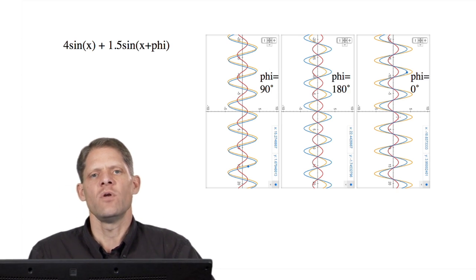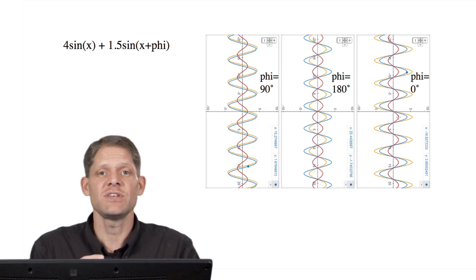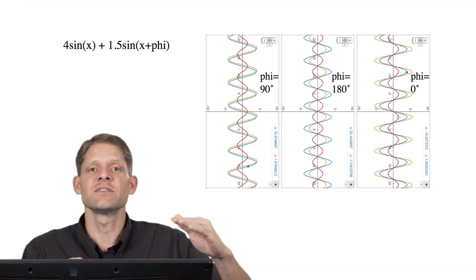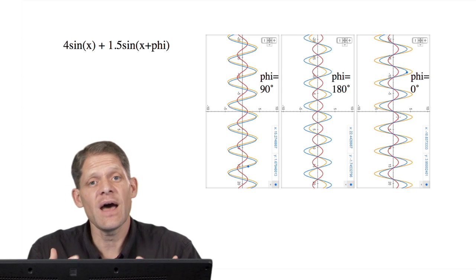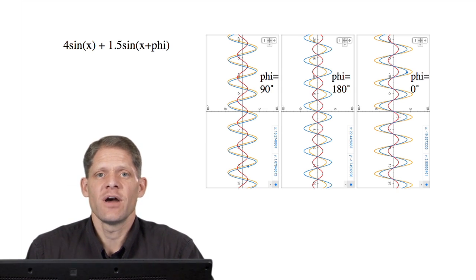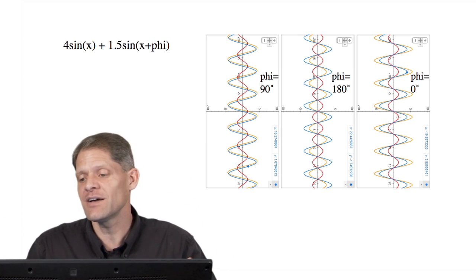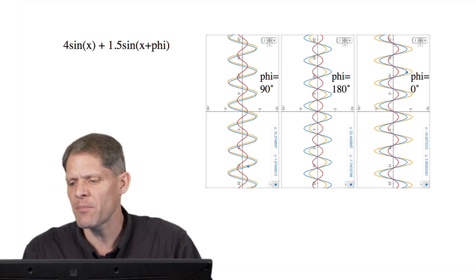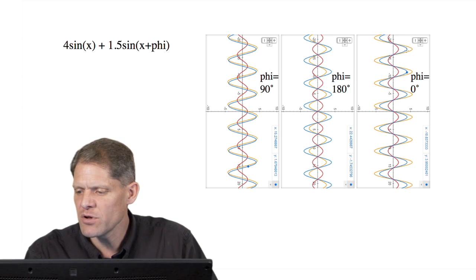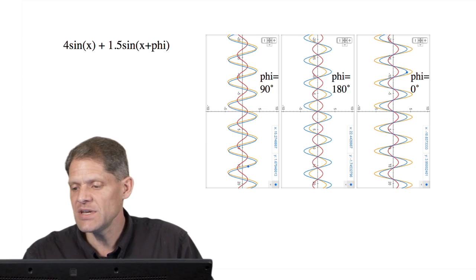So in this first scenario, we have an electron wave here shown in blue that is oscillating back and forth. Now, we don't know what about an electron wave oscillates. We understand that in a photon, what oscillates is the electric field. And that's why it's easier to understand light as waves. With an electron, we don't really know what is oscillating about it. Its electronness is oscillating. But whatever it is that oscillates, that gives it its wave-like properties, that's what we're trying to illustrate in blue here. Here's an electron wave moving down through the pixel of the detector with a particular phase and amplitude.